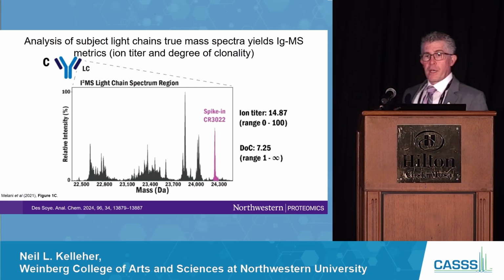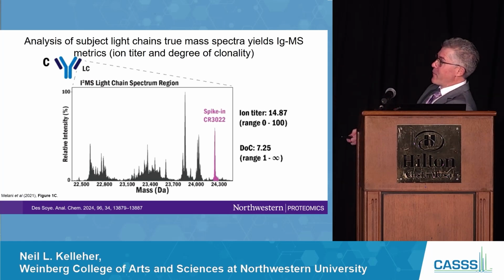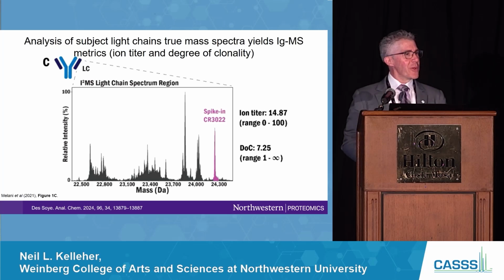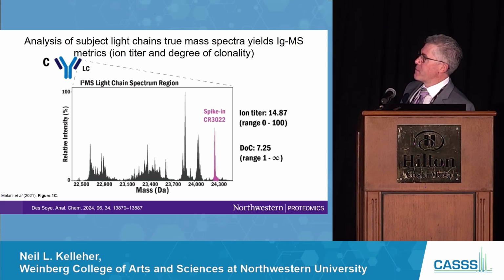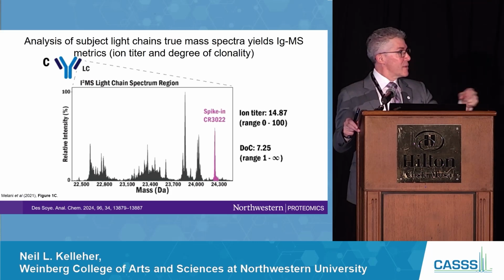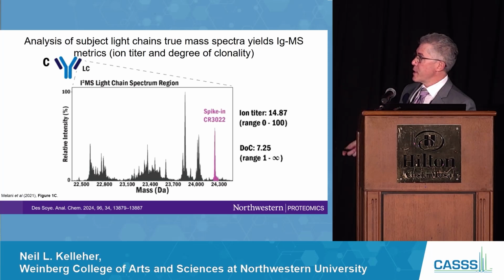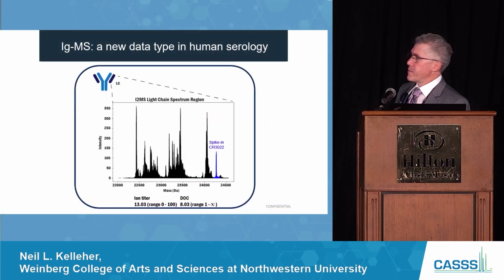And we also have data where people were actually on monoclonal therapeutics, and there'd be a monoclonal variant, and that has many implications, not just in COVID, but across oncology, as you might imagine. So we had to create metrics for the degree of clonality, like how many clones. And when you see much older people, they get fewer clones, less clonality, different B cell clones. We see anecdotal trends of that. We haven't done a detailed study design, but there's all sorts of potential uses for this method.